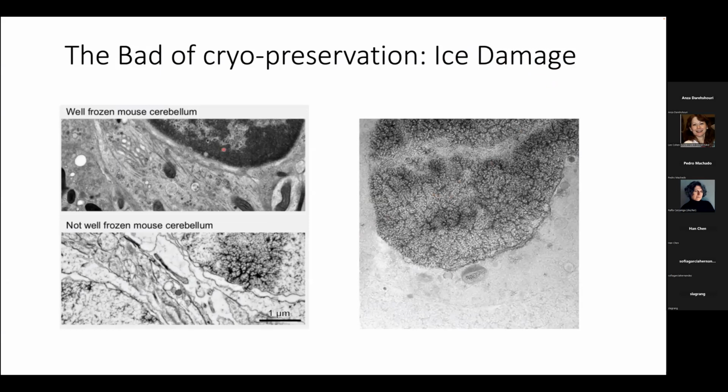As you form ice nucleation inside the cell during freezing, you can imagine that you're bringing water together and dehydrating the sample, bringing all of the cellular components into some compact form. And so as we go through the process where you move the vitreous ice out and replace it with resin, when we get to the TEM, what we see is this kind of spiderwebby look.